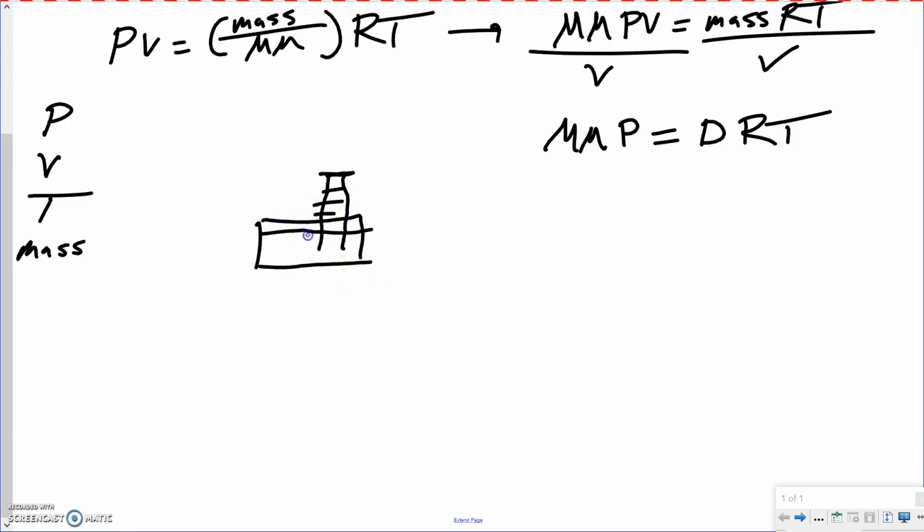Okay, from there, you're going to stick the lighter under the water, and lift up the graduated cylinder just a little bit so that you can get your hand and the lighter up underneath it. Make sure that at least the graduated cylinder does not go outside of the water level, because if it does, the water that you just filled the graduated cylinder with will come out.